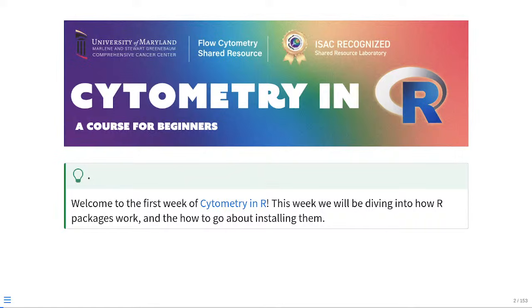But we also really, really need a class that's aimed at those who have no flow cytometry experience and that teaches how to do R at the same time as it's teaching flow cytometry. So that will be part of our goals in this course.